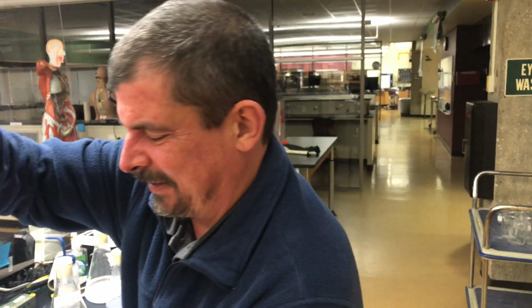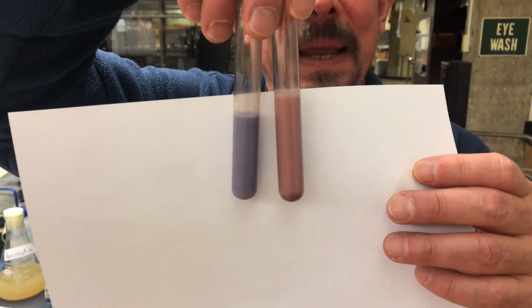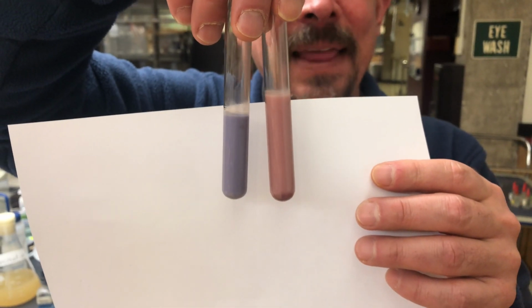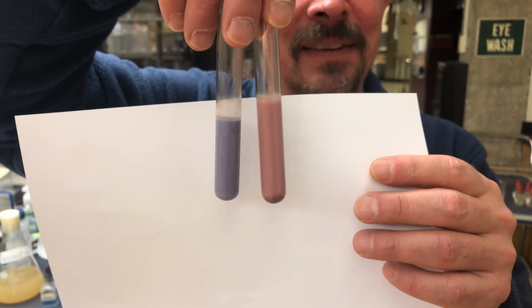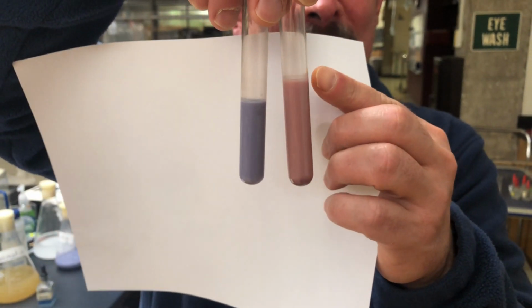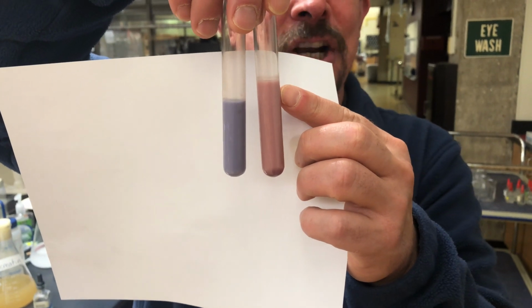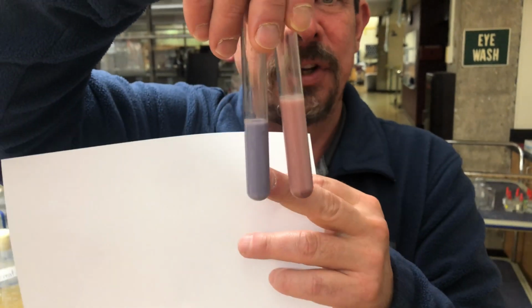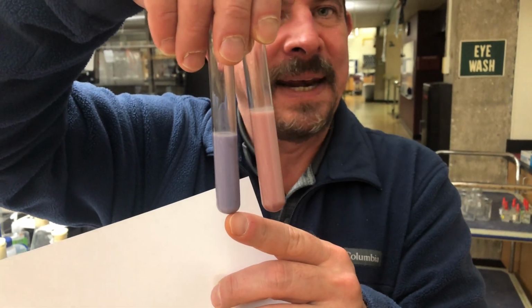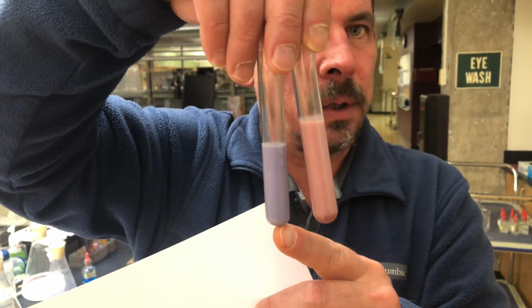So what we can see, we get one test tube comes out pink and the other remains purple. So right here, the pink test tube, that would be test tube number 3, because that is what we added the pancreatin to. And what this illustrates, the pink color, that illustrates that fat digestion did occur. Then now the tube that remains purple shows us no fat digestion. And that would have been test tube number 4.